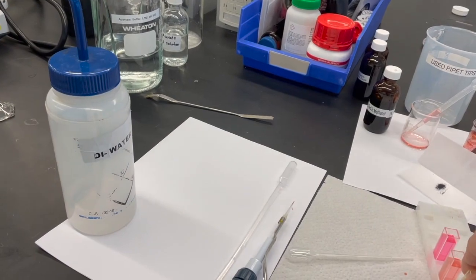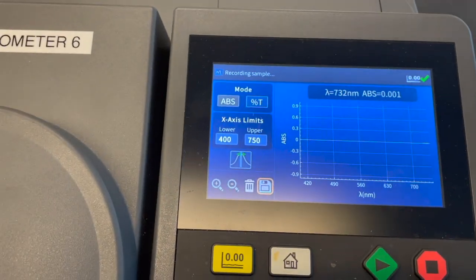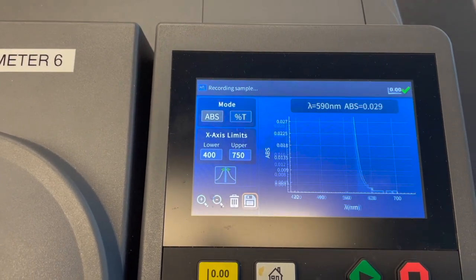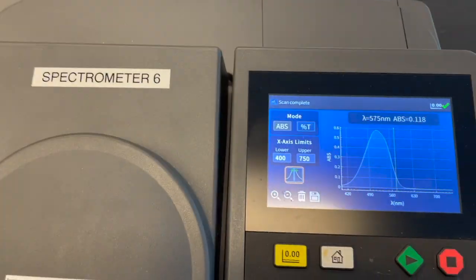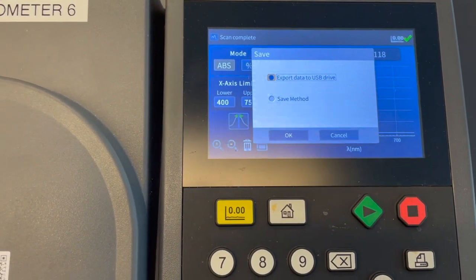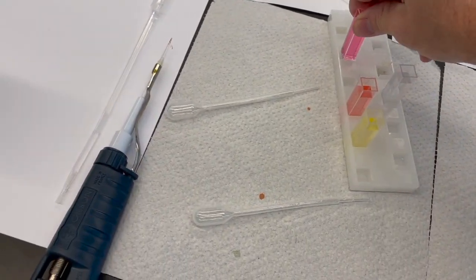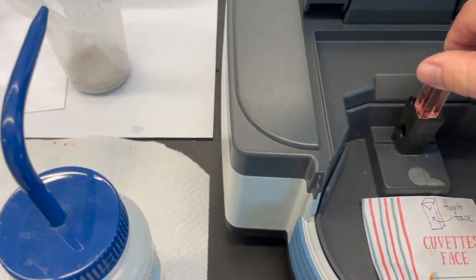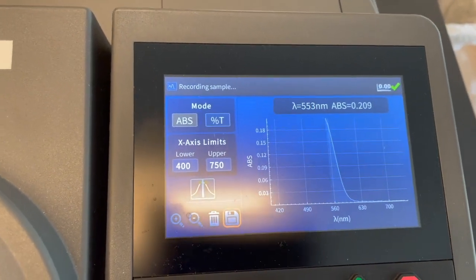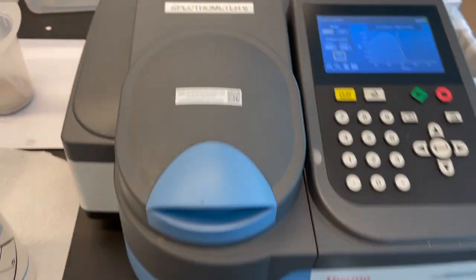Base sample out, acid sample in — the pink sample. Scan. Save. And that is done. Finally, the third sample is going to be the pH 5 sample, the orange sample, the in-between sample. And I will have these three files available for you in order to complete the calculations of the pKa.